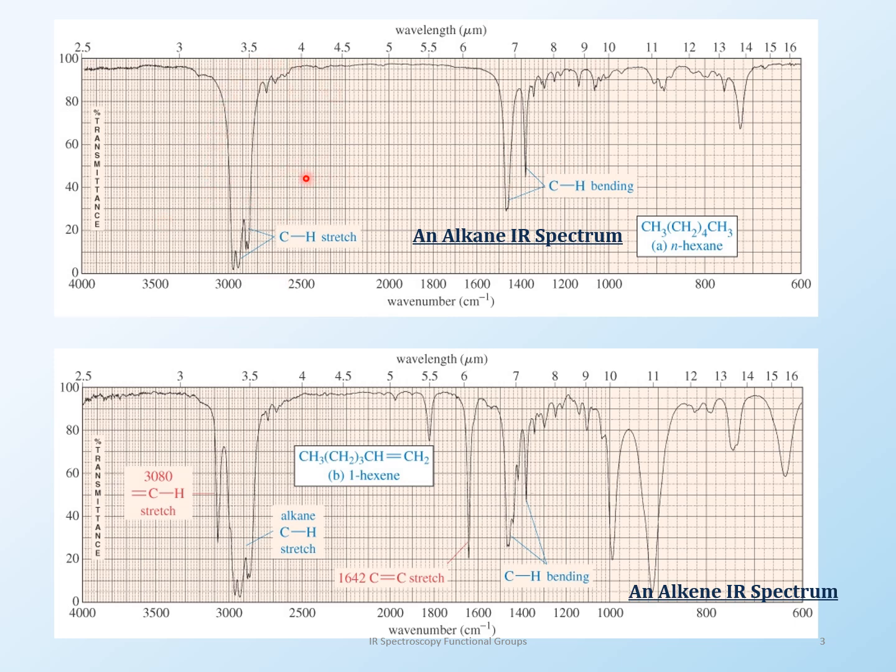Now, when you have an alkane, like this one is hexane, and then you have octane, so on and so forth, the different kinds of alkanes will give you a different spectrum. It's not like they all will look like this. They will give you a different spectrum, and they might be different here in the fingerprint region. For our purpose, I generally don't give you any kind of hydrocarbon to analyze in IR, because how would you? There is nothing characteristic about it.